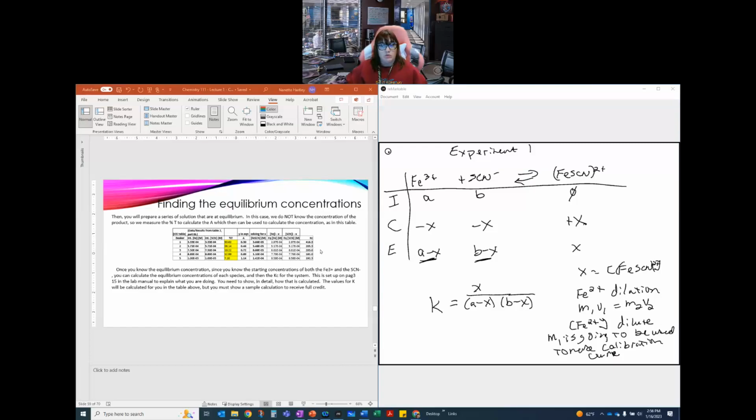Now, what you'll see in this and what you'll see in your own data is that they're not always the same. They should be. If they're not, why are they not? Give me some speculation as to why they might not be. And that speculation should be based on what was done in the laboratory. So there are a couple of things that you could be looking at that could have happened. Obviously, we could have had contaminated solutions. We could have had mismeasurement of things going in to make our standards so that they're not exactly the concentration they're supposed to be. You may see that this is slightly deviated from an actual line because there is only a finite region over which this is linear. So it may be a deviation in that. Think about things that may be coming up in this.